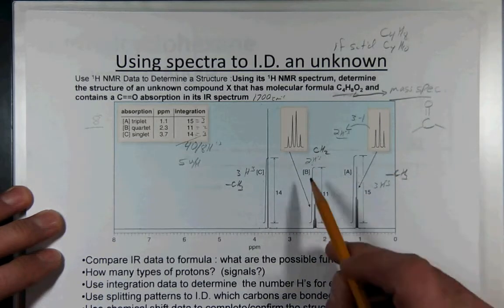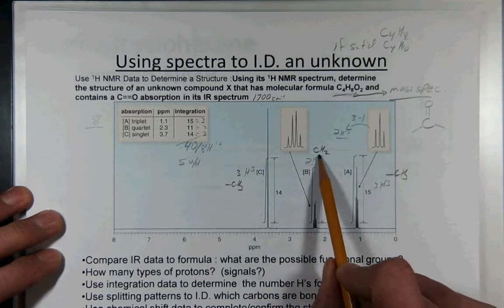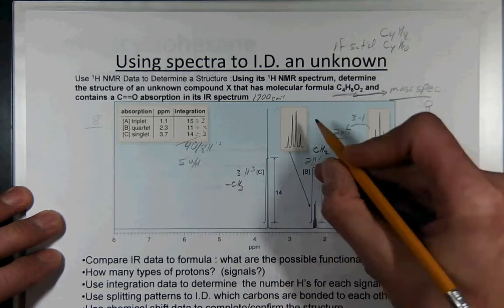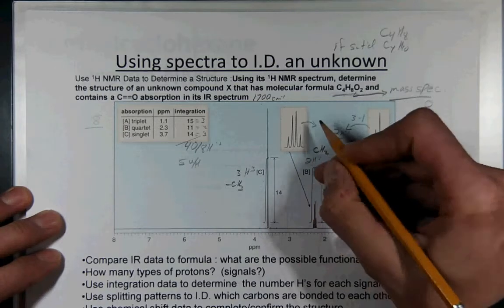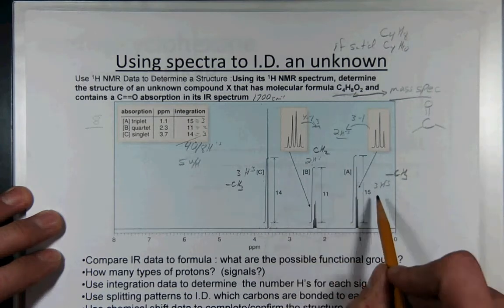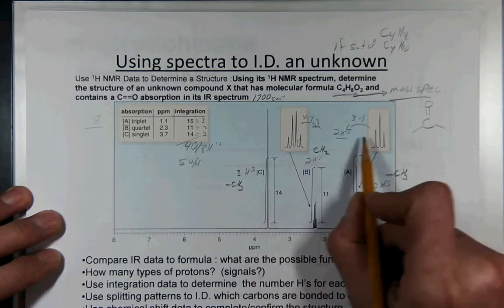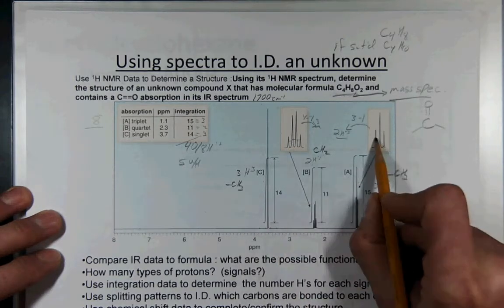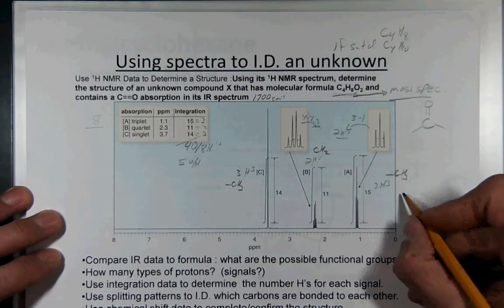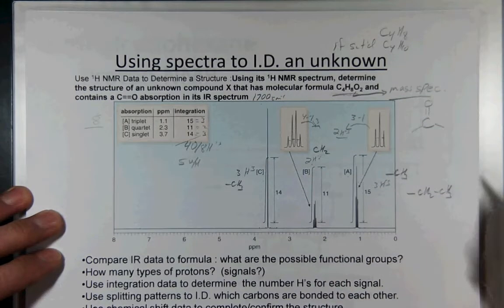So this is that classic example of a triplet quartet. If you look at these 2 hydrogens, they are split into a quartet. Again, with the n-1 rule, 4 minus 1 is 3. These guys have to be next to these. And if you want to get really picky, the J coupling here would be the same as these guys. So we know that they're coupled, that they're actually splitting each other. So from these 2, we have a CH2, CH3.